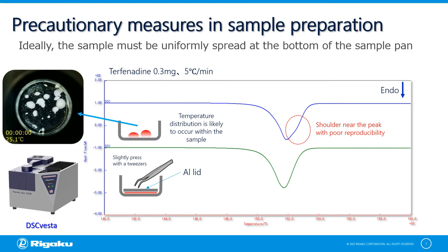Sample preparation is essential to accurately obtain the significant thermal behavior of a material. Especially when measuring with a small amount of sample, disperse the sample thinly on the bottom of the sample pan. If the samples are in different granular sizes, a temperature distribution will occur within the sample, which may result in a shoulder at a peak. In such case, after putting the sample in a sample pan, place an aluminum plate as a drop lead and lightly press it with tweezers to bring the sample into close contact with the bottom of the pan to distribute the temperature inside the sample. The shoulder may become smaller and disappear. If the sample has a shoulder in essence, it should be reproducible, so if a peak is not reproducible, try preparing a sample in this manner.